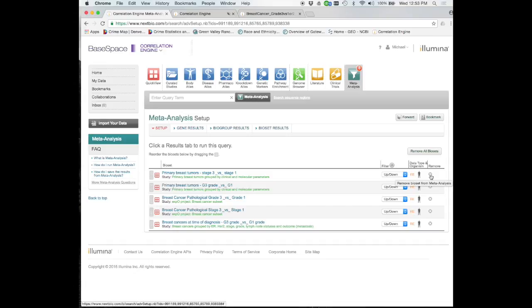That's what makes this nice, is we are now in a curated system. I don't have to download this and analyze this myself. I trust Illumina. Illumina sequences 95% of everything on this planet. I'm going to trust that they did a good job of normalizing and processing this data.